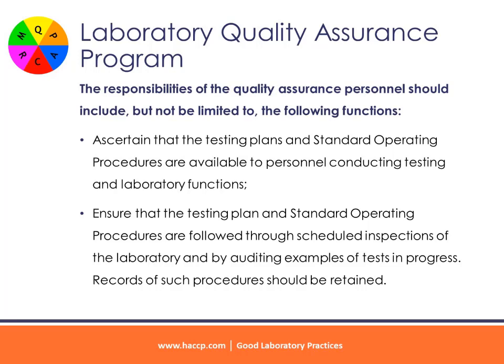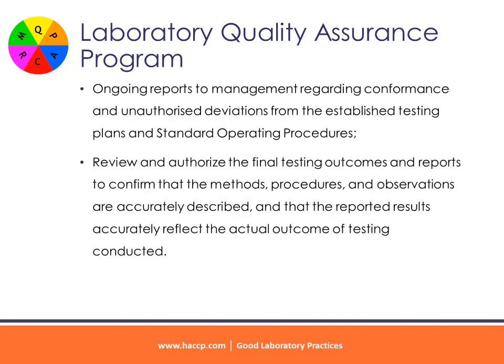Ensure that the testing plan and standard operating procedures are followed through scheduled inspections of the laboratory and by auditing examples of tests in progress. Records of such procedures should be retained. Ongoing reports to management regarding conformance and unauthorized deviations from the established testing plans and standard operating procedures.